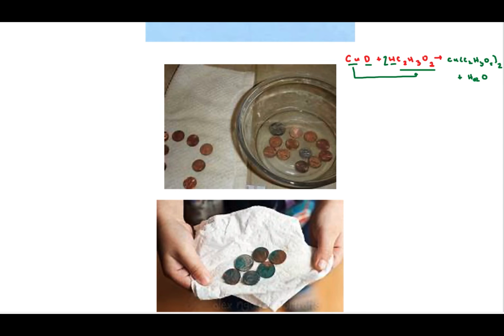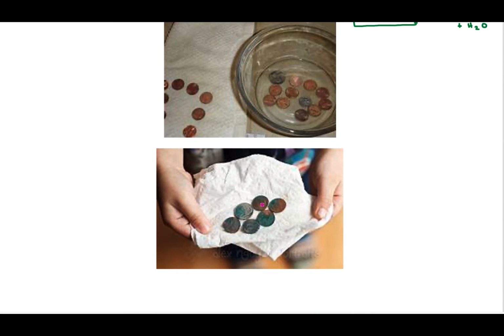All right, so the important thing for you guys to know is this copper ion is going to be in solution. And because in addition to vinegar, we put salt in there, there's also going to be chlorine in there. So I'm simplifying this because there's some concepts that we haven't covered, but we're going to assume that the copper is going to form a compound with the chlorine. And when it also reacts with oxygen, that's how we get this blue substance, and that is called malachite.